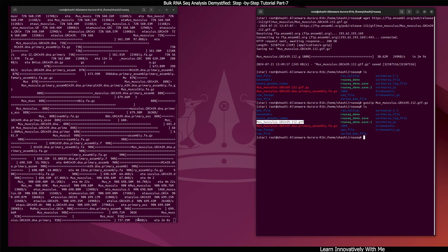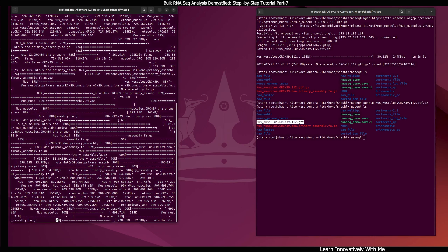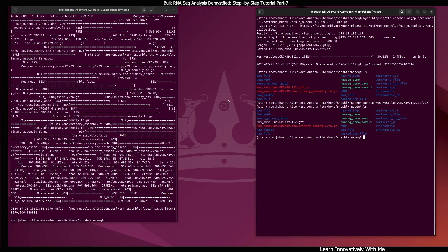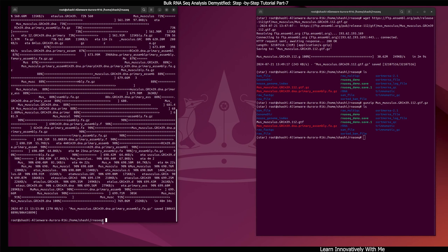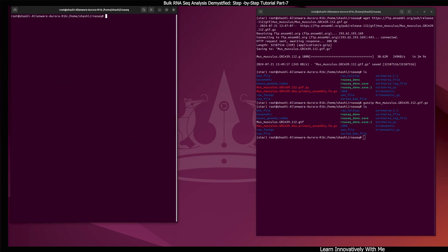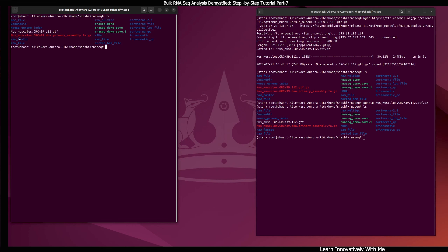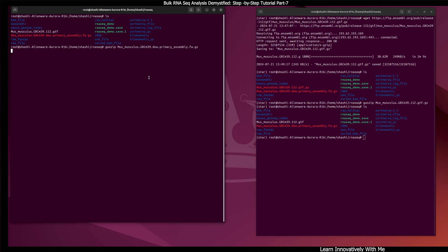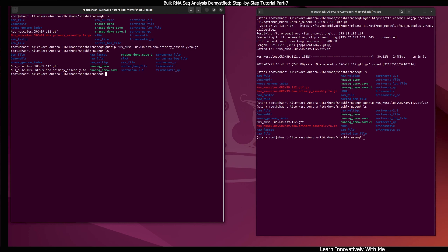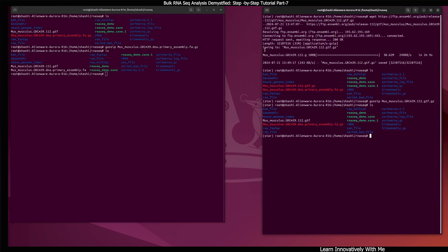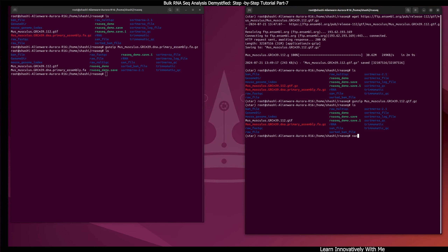The GTF file — Mus_musculus.GRCm39.112.gtf — is now present. The genome file is at 96% and now it's fully downloaded. The genome file is also in gzip format, so I'll unzip it using gunzip. After unzipping, I'll check again — the genome FASTA file is now unzipped and ready.